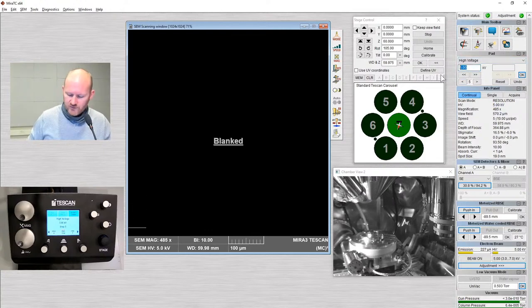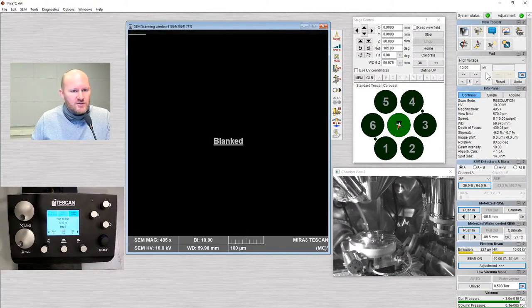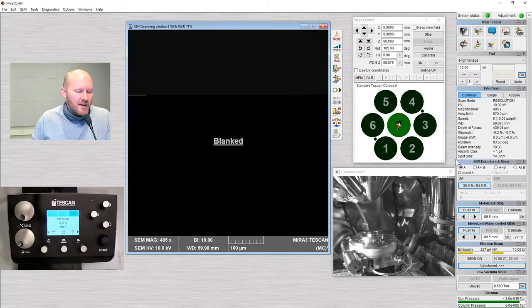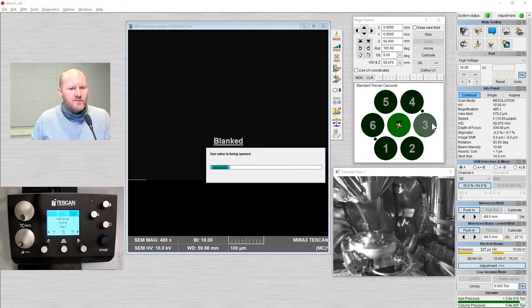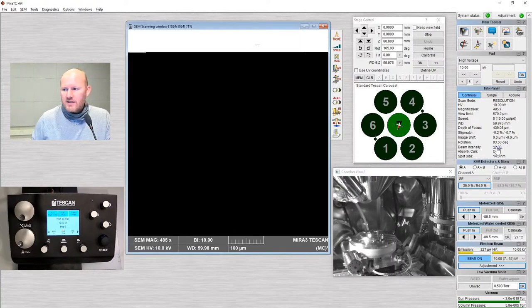High voltage goes from 0 to 30 kV. 30 kV is very high — I'm going to start with 10 kV. All modern SEMs work very well at lower voltages; there's less interaction with the electron in your sample at lower voltages. 30 kV and high kV is, in my opinion, mainly for electron backscatter diffraction and x-ray work. We've set our initial conditions: high voltage 10 and beam intensity 10.